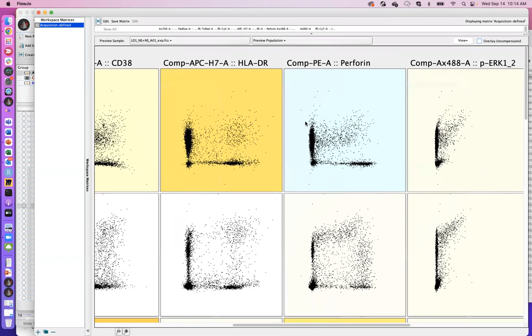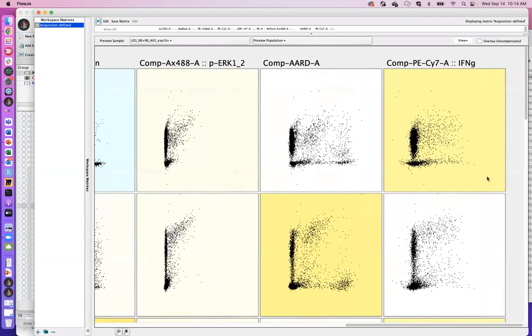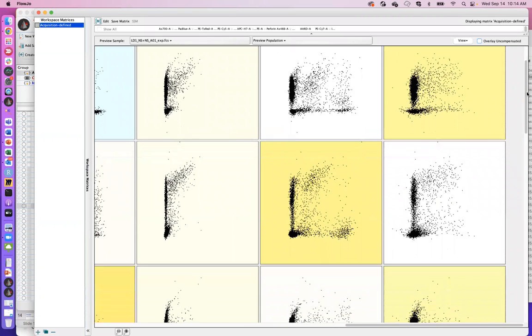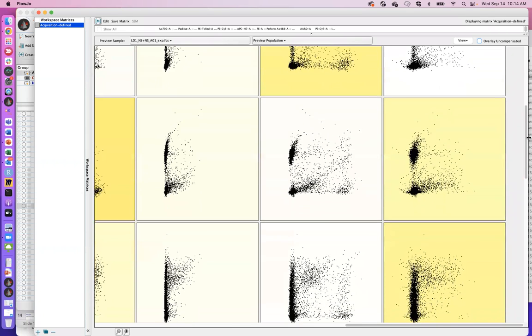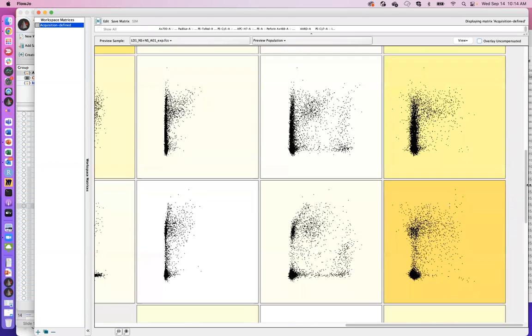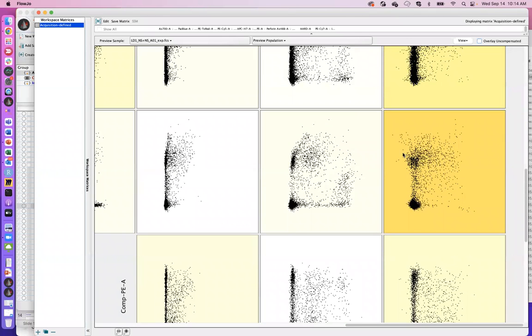Don't be afraid if these single positive populations begin to fan out a little bit. They sometimes form trumpet-shaped populations, or dumbbell-shaped populations. That's okay, so long as the dumbbell or the trumpet is evenly distributed across the negative and positive, and the middle of that trumpet, again, matches the middle of the double negative population. Okay, so here's a trumpet-shaped population that you can see forming a funnel as it gets brighter. But again, I'm making sure that the middle of this population is matching the middle of the double negative.